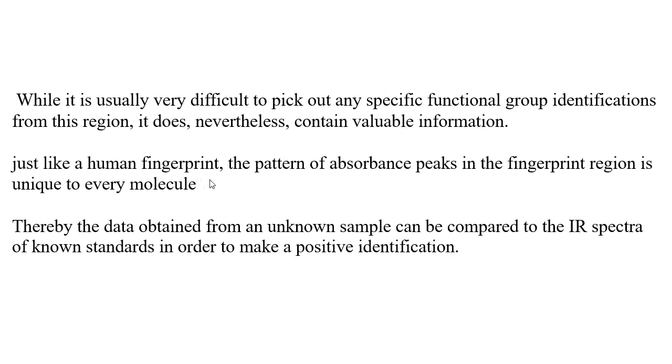Just like a human fingerprint, the pattern of absorbance peaks in the fingerprint region is unique to every molecule. Thereby, the data obtained from an unknown sample can be compared to the IR spectra of known standards in order to make a positive identification. That is how molecules are identified using IR spectroscopy.